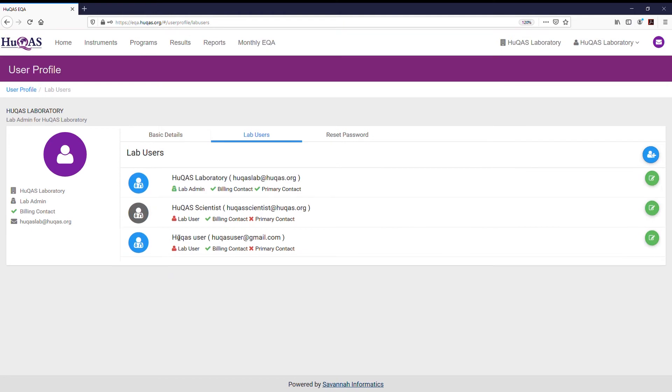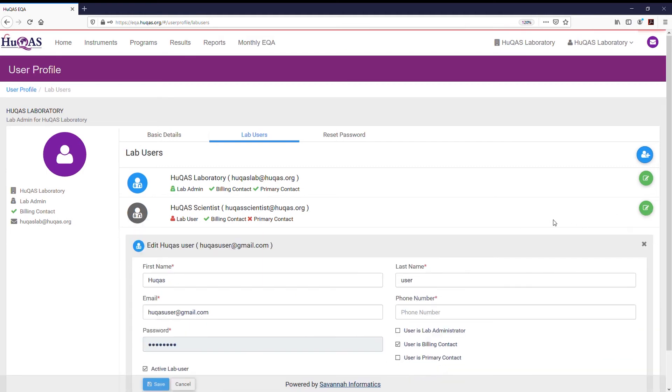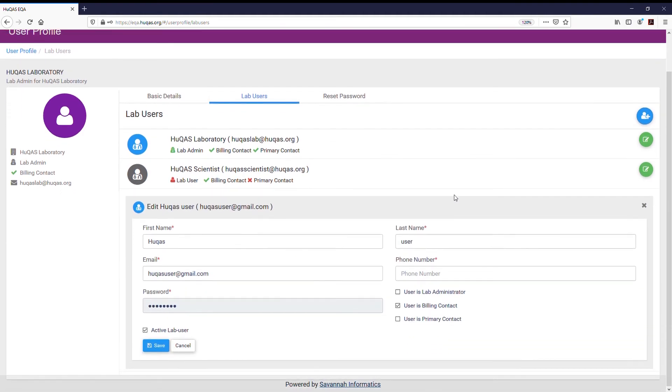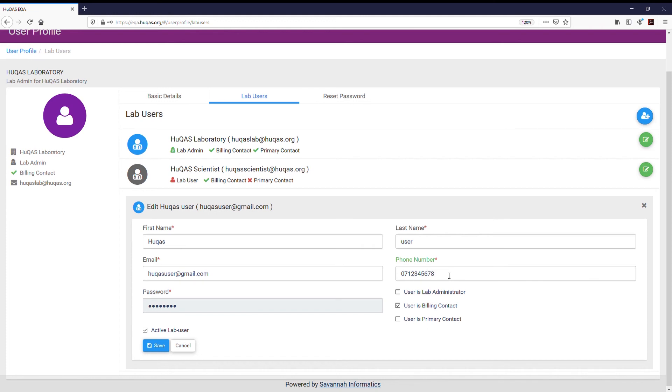To edit a user, click the green circular button that corresponds to the user you wish to edit. This reveals a form with the user's details which you can edit as you wish. Click save to store your changes.